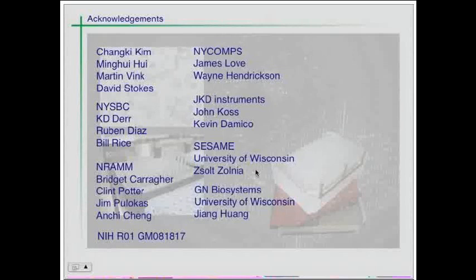So we think that to evaluate each grid, it takes in the order of 20 minutes. So as I said, it's basically 25 grids in 18 hours.